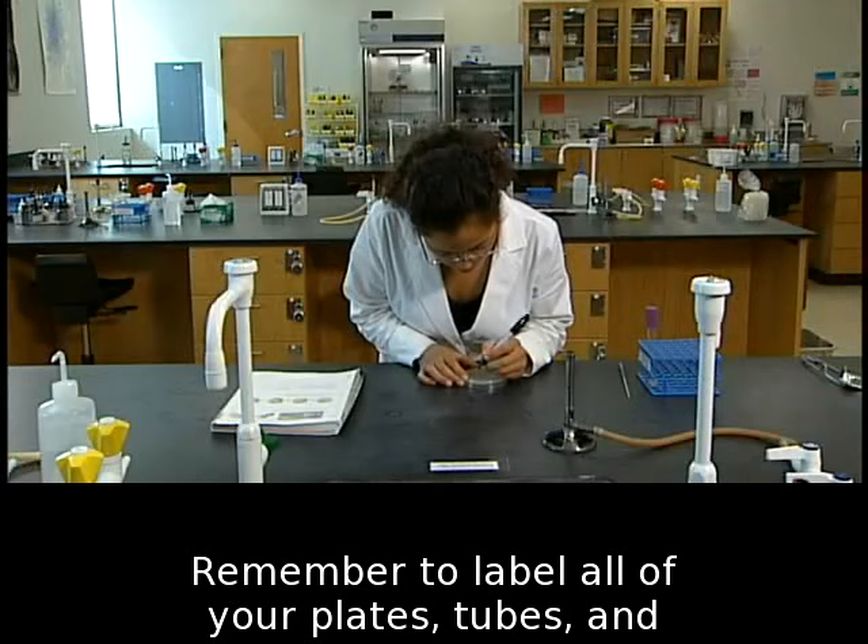Remember to label all of your plates, tubes, and slides so you can identify their part of an experiment.